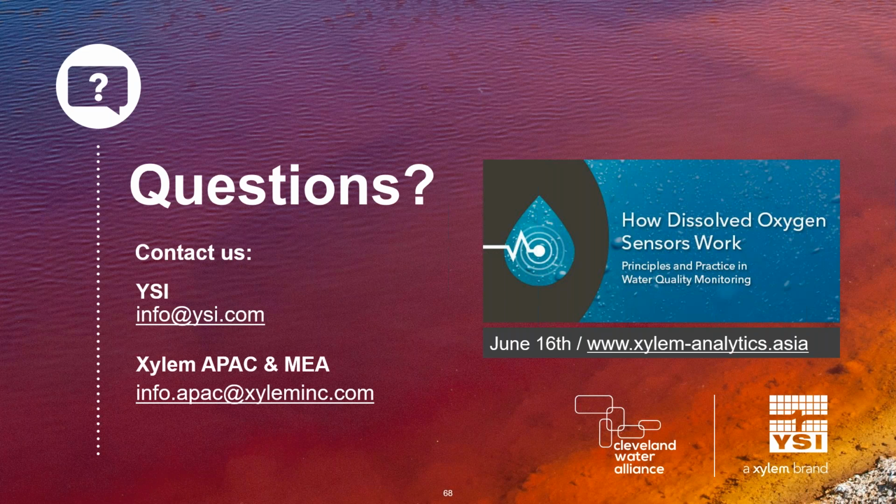You can. That should work just fine. It has a ton of ions in it, and because it is acidic, it's less likely that bugs will grow in that buffer. So that's a good second choice if you don't have the fill solution. I have no qualms about putting that in pH 4 buffer. It's the second choice, but it's still a good choice.